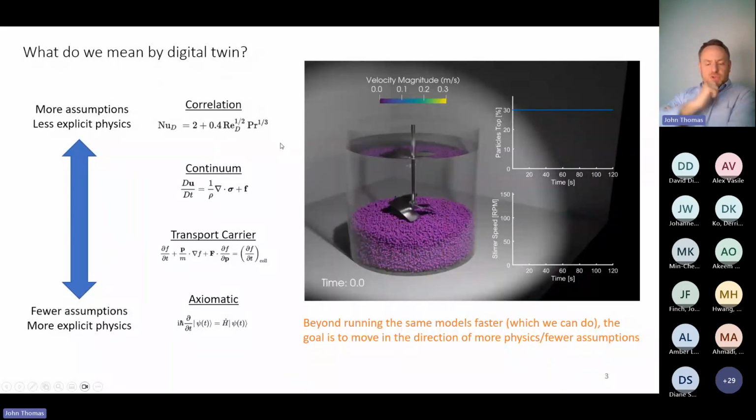We're talking today about digital twins and digital twins of bioreactors. Now, digital twin is a word that gets bandied around quite a bit. What I mean by digital twin is a physics-based modeling paradigm for predicting physical outcome. I don't mean a correlation lookup tool. I don't mean just a response surface, as it were. I mean a tool that solves governing equations of transport to make predictions that are indistinguishable from what we measure inside the lab, as it were.